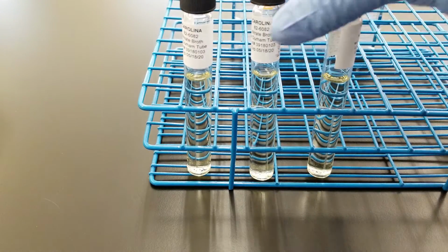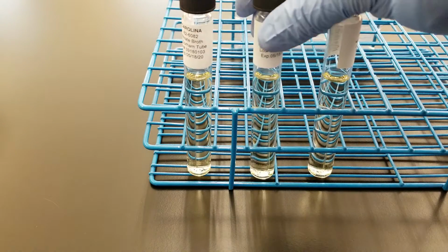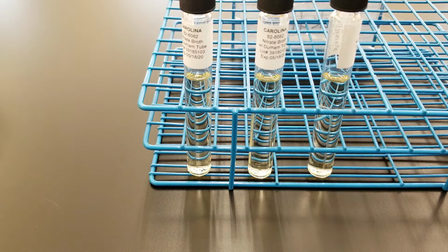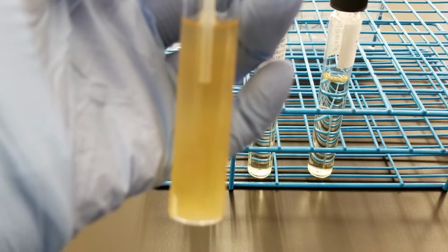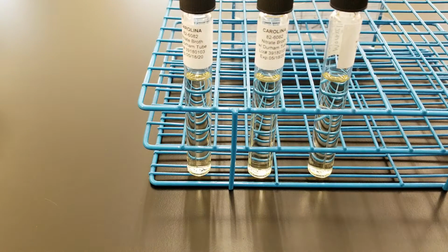So now we're going to do the next one. So this one's going to be Neisseria meningitidis, and we're going to do it from a thio tube this time, so you can see that. Lucky you. You want to go down where there's a lot of growth. Luckily, there's a lot of growth in here anyway, so that's all right. And this is going to be capped and put back.